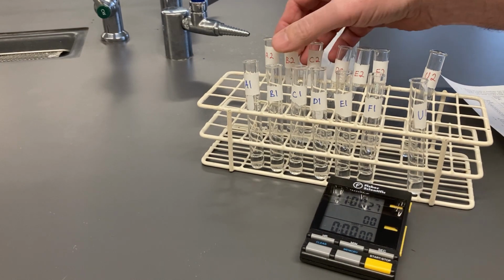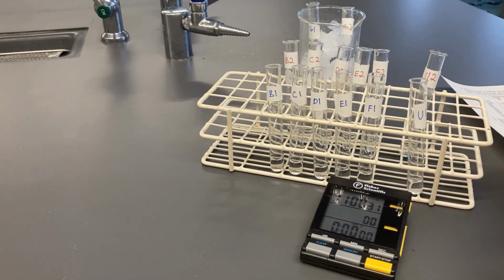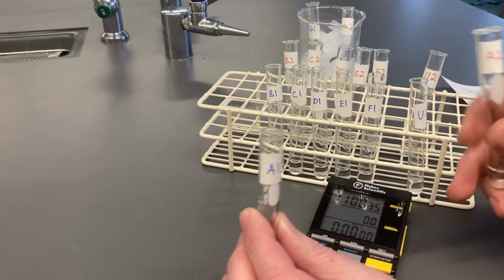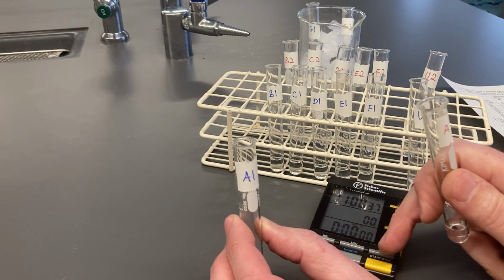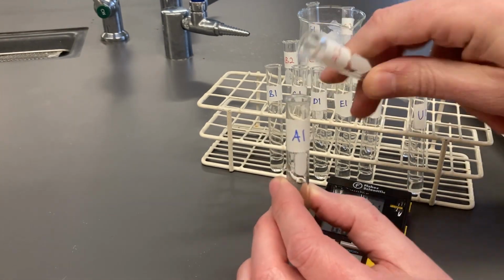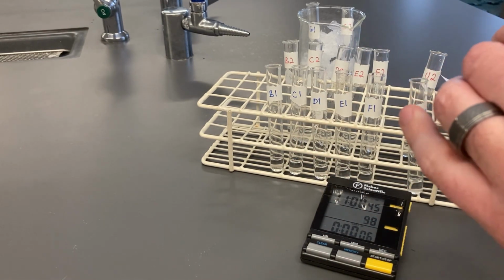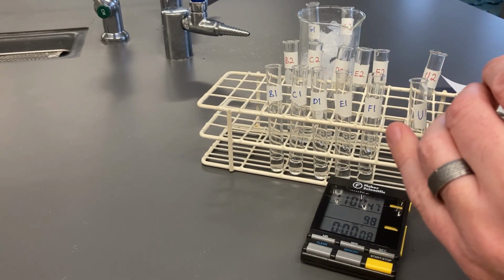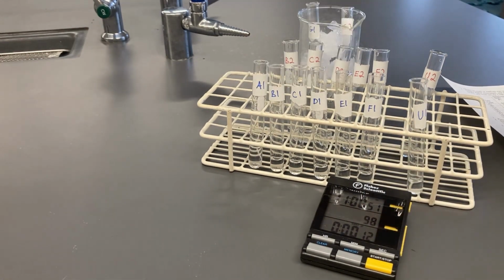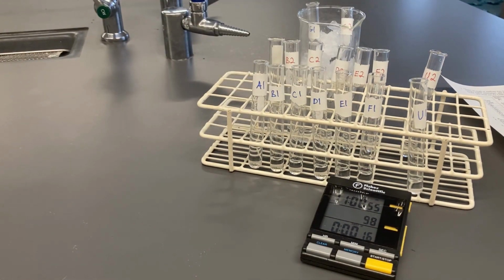So I'm going to take my A2 and my A1, and I am going to start the timer and then pour. And I pour back and forth a little bit to mix it well. And then we'll let that sit, and you'll want to watch for the color change there.